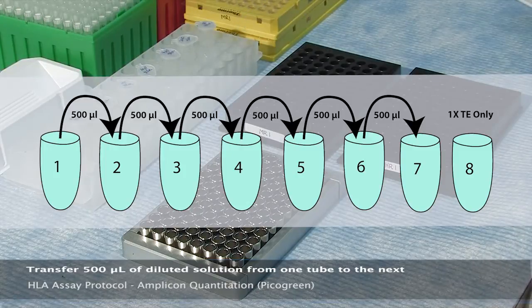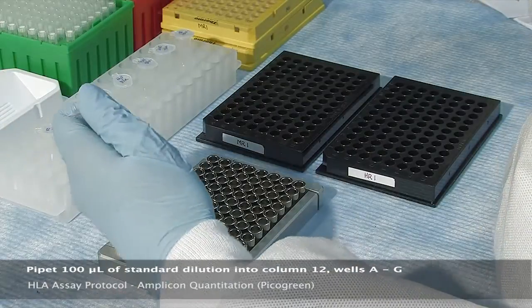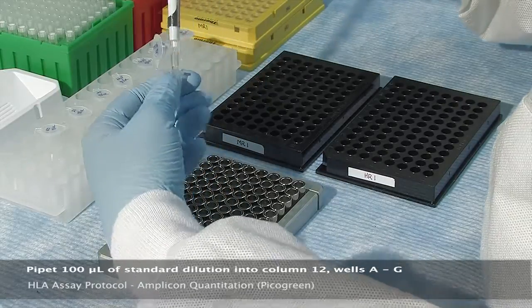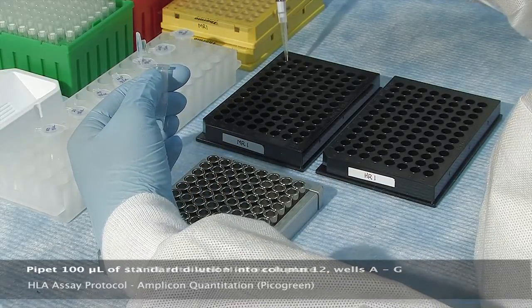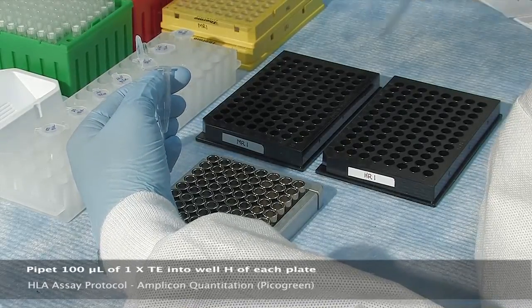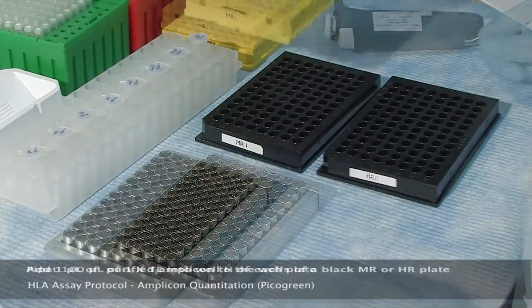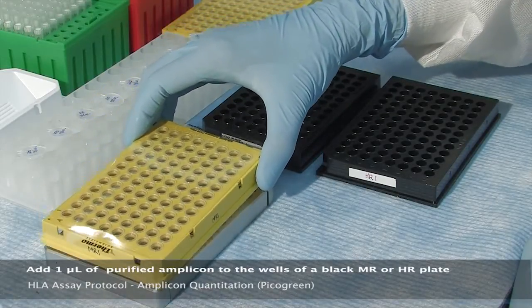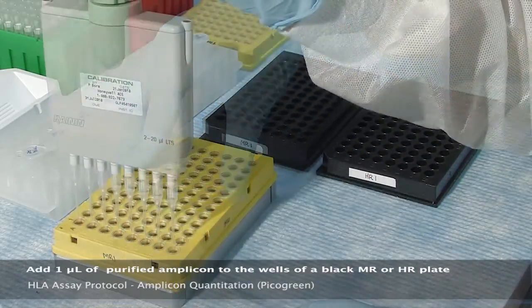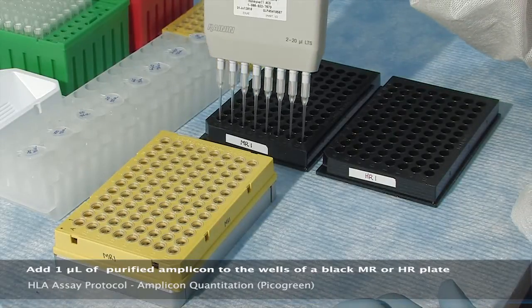Please note that tube eight contains TE only. Next, pipette 100 microliters of standard dilution into column 12, wells A through G of each black 96-well HR and MR plate, and pipette 100 microliters of 1X TE into well H of each plate. Place the purified amplicon plate onto a magnetic ring stand and transfer 1 microliter of each purified amplicon to the corresponding wells in a black MR and HR plate using a multi-channel pipetter.